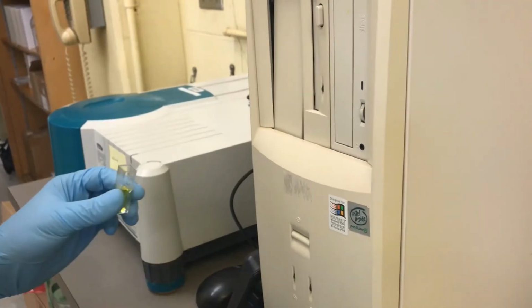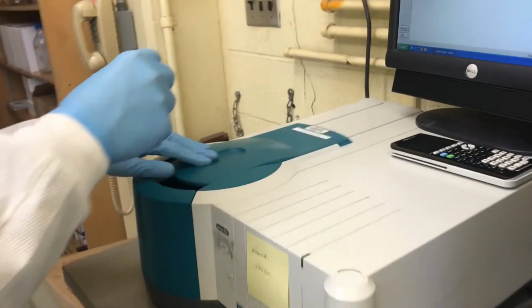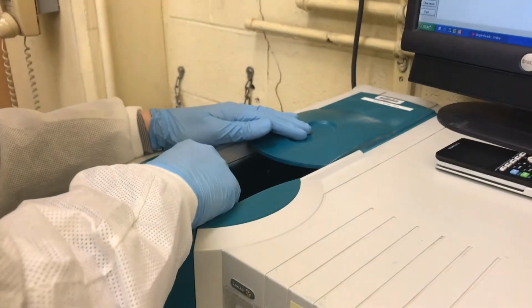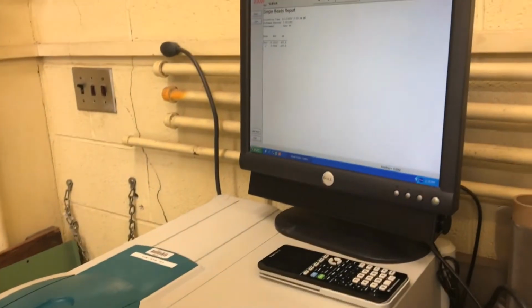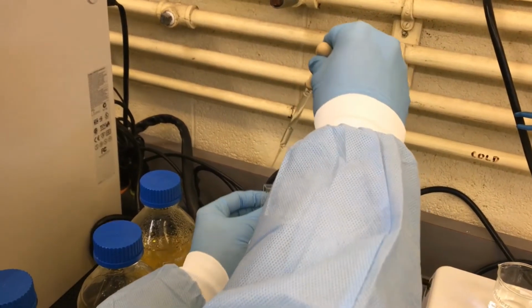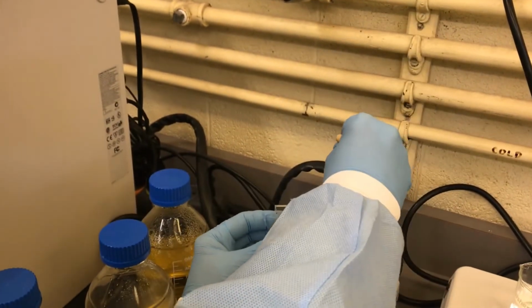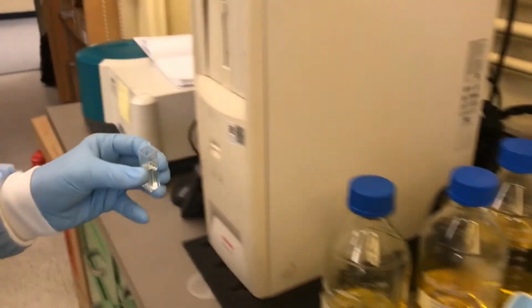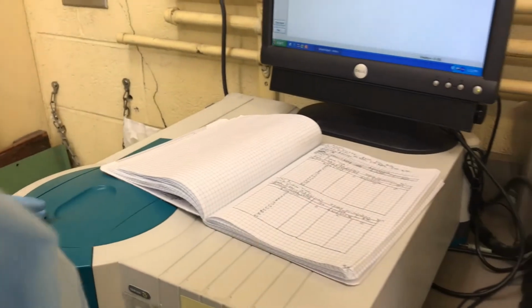In taking measurements, samples must be taken from the beaker once every 2 minutes for the first 10 minutes, once every 5 minutes for the next 20 minutes, and then once every 10 minutes for the next 30 minutes. To take measurements, use a Pasteur pipette to draw a small amount of water from the beaker and empty it into a cuvette. Put the cuvette into the spectrophotometer and record the absorbance.